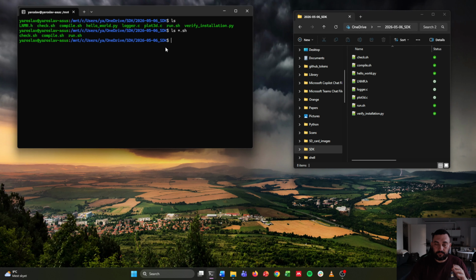After the program is done, another program is launched by the shell script, plot3d, which eventually makes a 3D plot of the time scan and displays it on the computer screen in a window, as well as saves the PNG file in the folder.